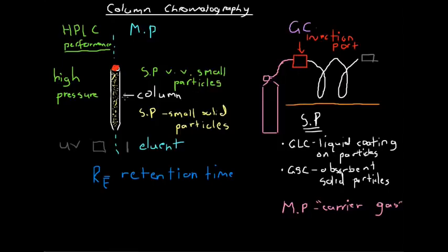And so just the same way that components of the sample are separated here, components of the gaseous sample here are separated based on how they adsorb and desorb to the stationary phase inside the column. So it's very similar, however, basically everything's just converted to a gas by having everything at very high temperatures. So again, what we have at the end is a detector which detects any changes in the eluent that's coming out of the column at the end. And by detecting changes in that substance, it can detect how the different components separate through the column.